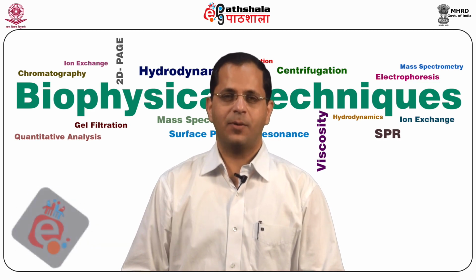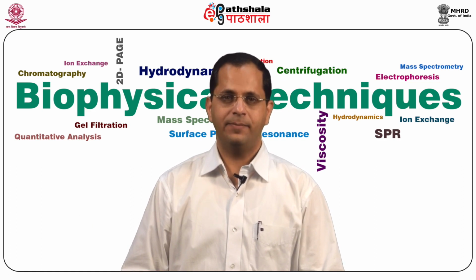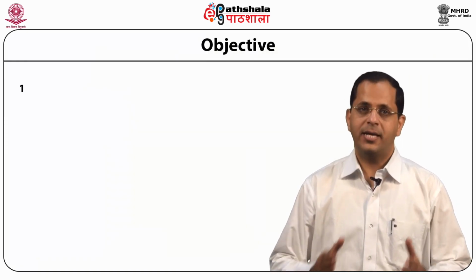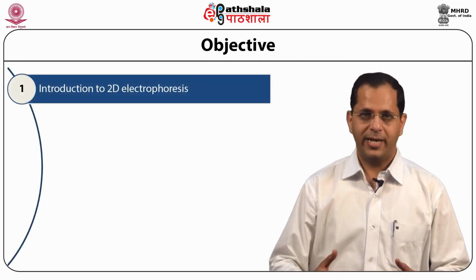Today we are going to discuss the module Two-Dimensional Electrophoresis under the paper Techniques in Molecular Biophysics Part 1. So students, let's see what we are going to learn in this particular module. We'll start with the introduction to 2D electrophoresis.